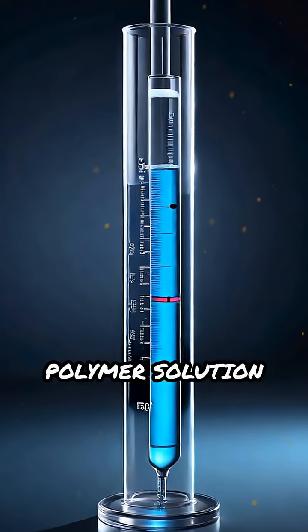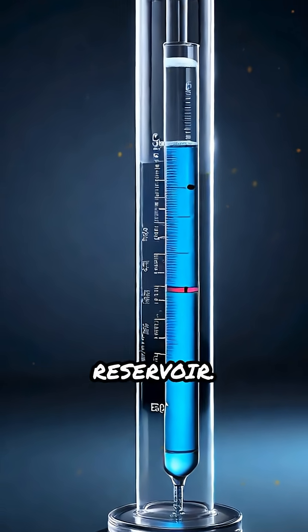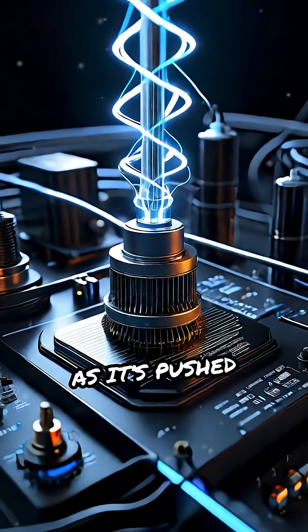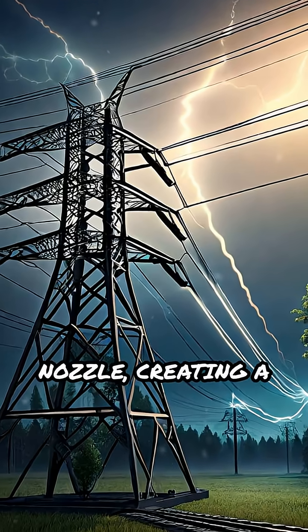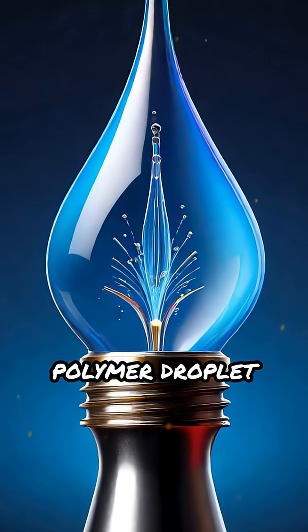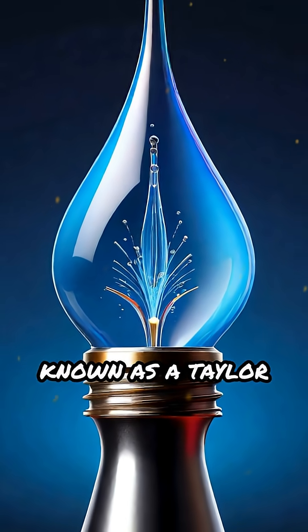The process begins by loading the polymer solution into a syringe or reservoir. A high-voltage power supply then charges the solution as it's pushed through a tiny nozzle, creating a strong electric field. This field pulls the polymer droplet into a cone shape known as a Taylor cone.